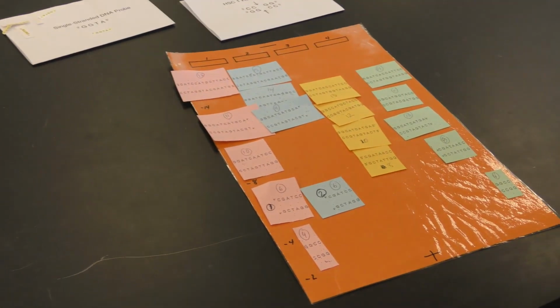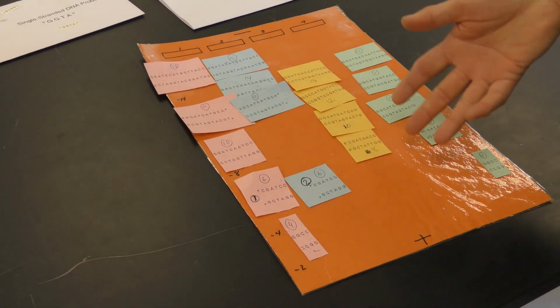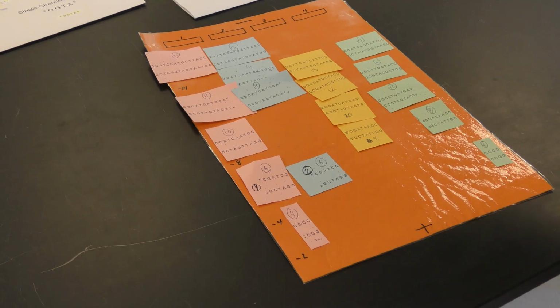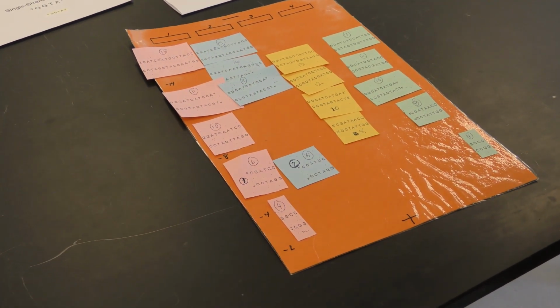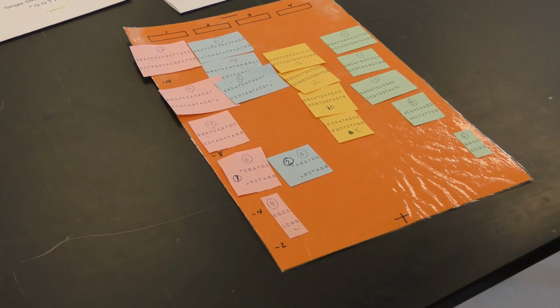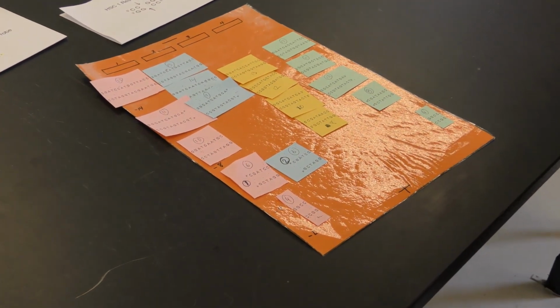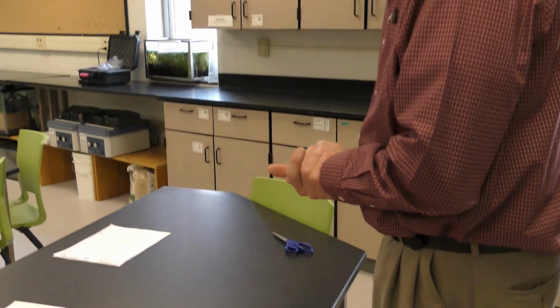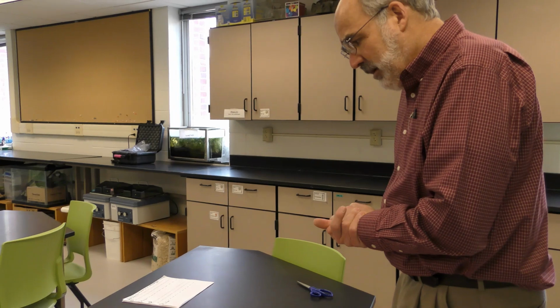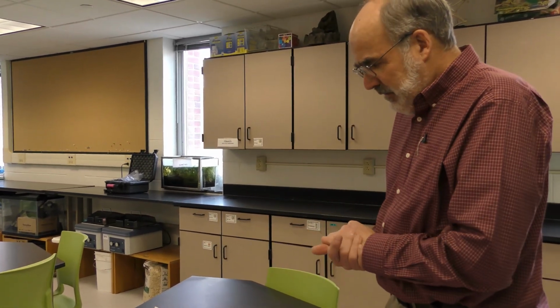And the same thing can be said about DNA 3 and 4. DNA 3, we see 4 fragments here, but DNA 4 has 5 fragments. So you can see the pattern, or fingerprint, is completely different between all 4 DNAs. So on the basis of DNA fingerprinting, you can separate those and say that they are different DNAs, which is true. Now, this works when you're working with very small pieces of DNA with a small number of base pairs.